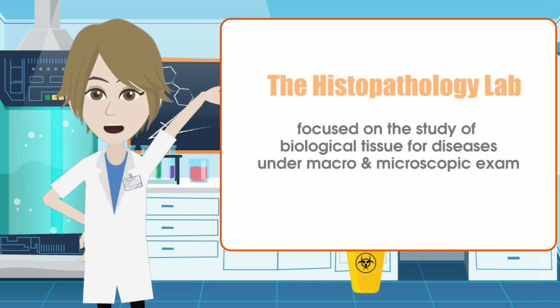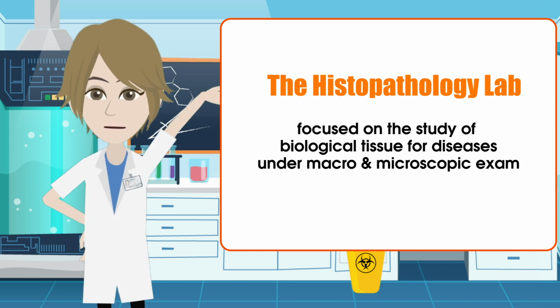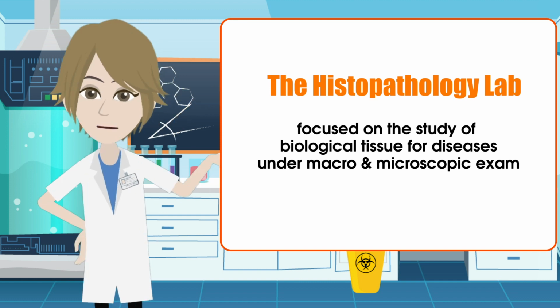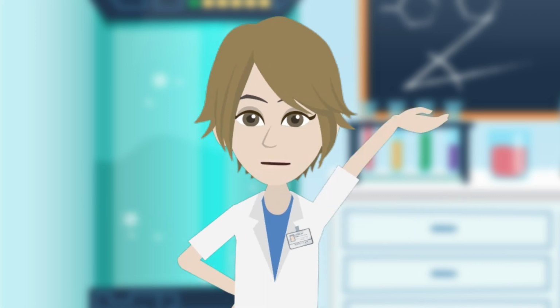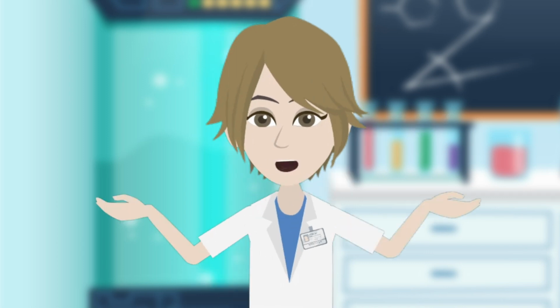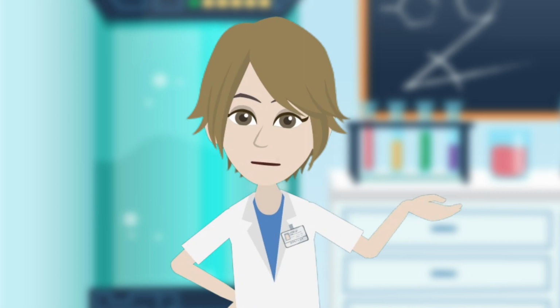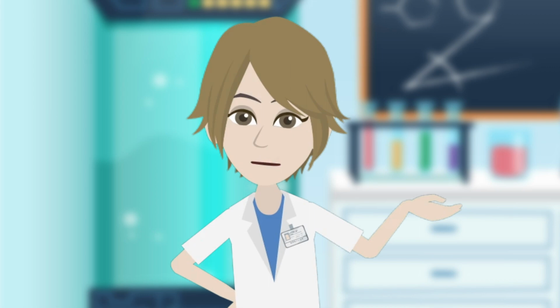In this video, you will learn about the processes and tests performed in the tissue processing techniques in a histopathology laboratory. Histopathology focuses on the study of biological tissue for diseases under macroscopic and microscopic examination. The examination is done on biopsy or surgical specimens by a consultant pathologist, and focuses on the study and analysis of biological molecules at the molecular level for medical and clinical purposes. This plays a crucial role in the diagnosis, monitoring, and treatment of various diseases.